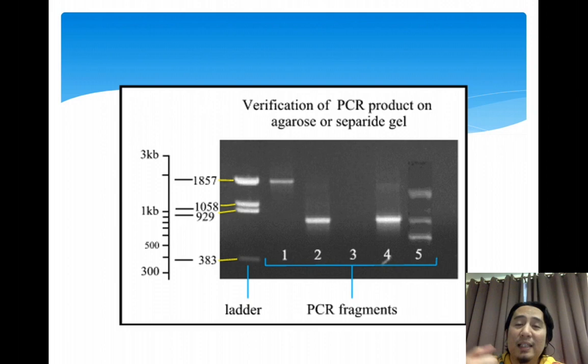The purpose of the DNA purification is to get rid of nonsense proteins or, you know, whatever carbohydrates and so on that are in the cell. So we want to get rid of it until we get a pure DNA. The same goes for PCR. After we complete the PCR process, we run everything in the agarose gel, and we need to purify this band. So what we have to do is cut this specific site of the band.